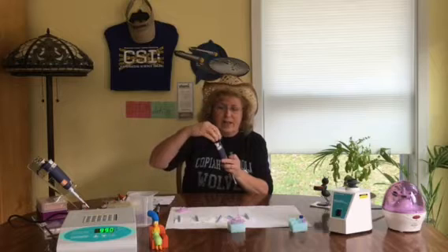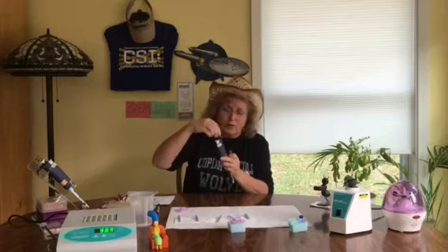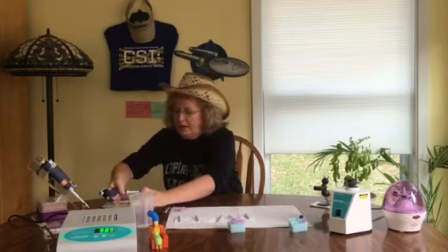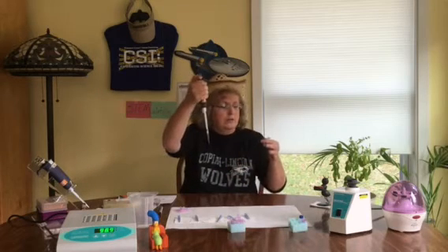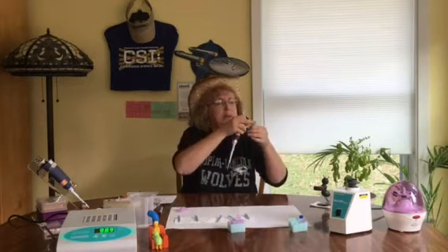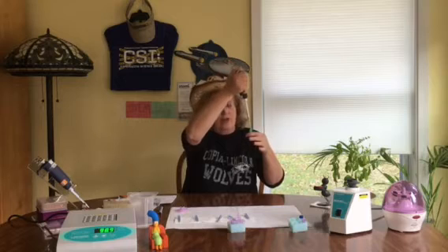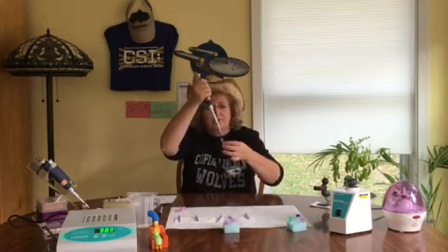200 microliters. So using your P200, make sure it is set on 200. It should read 200. Once you dial that up, make sure you lock it in. Go ahead and get your tip. 200, only going to the first stop. It still looks like it's suspended, but I'm going to shake it like a Polaroid picture one more time, okay? First stop in the Instagene, slowly retrieving it, close it, add it to your insect.